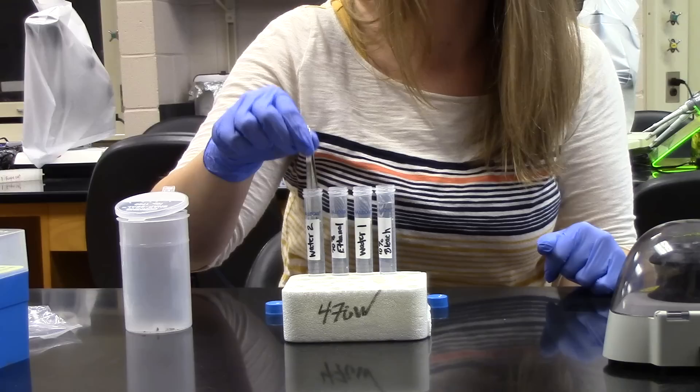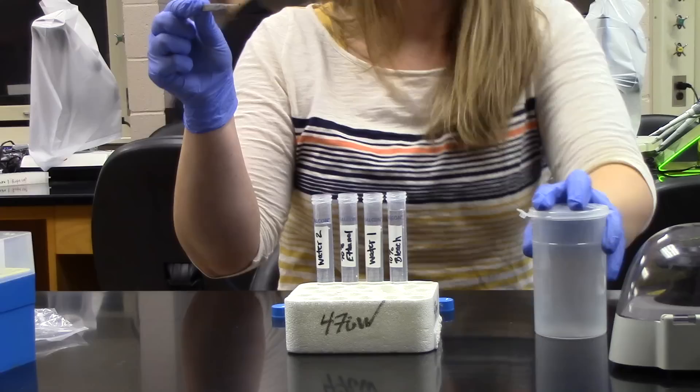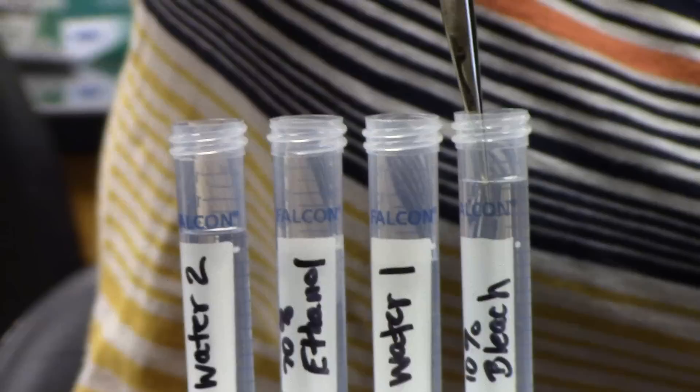Once our tweezers are sterilized, we can collect our bean beetle. Make sure you have a good hold on the beetle so that you don't lose it throughout your wash. And the beetle goes into the bleach for 3 seconds.